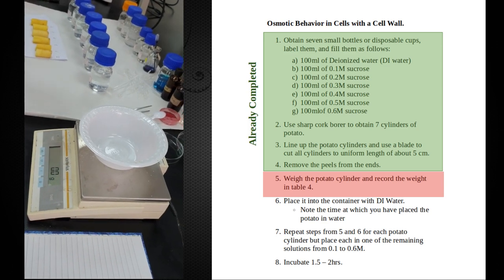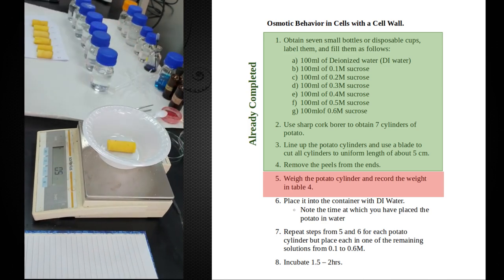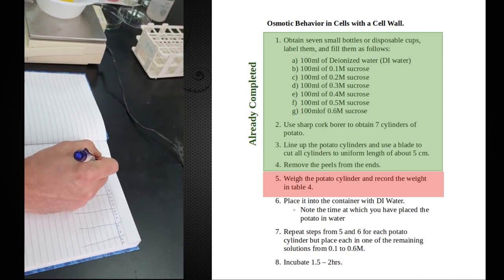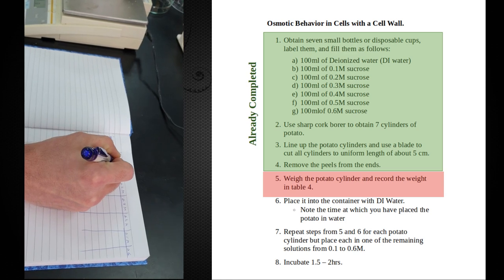Okay, so first piece of potato, really exciting stuff here, is 15.9 grams. So I'm going to write that down as my initial weight, 15.9 grams.